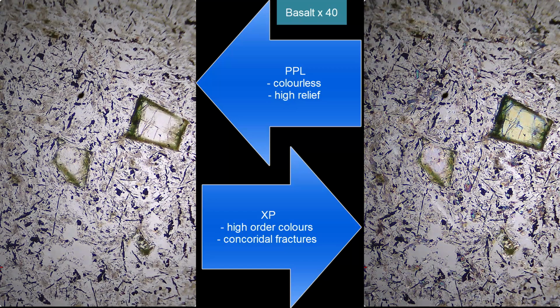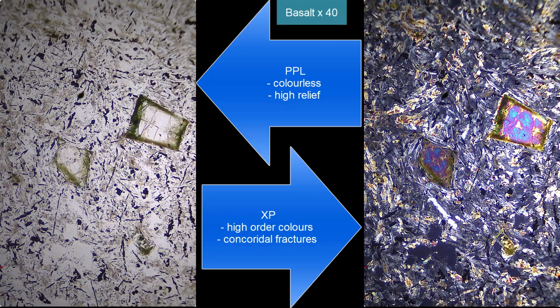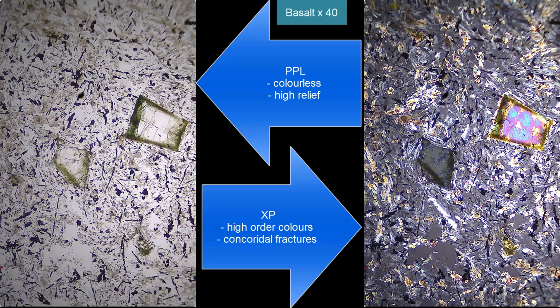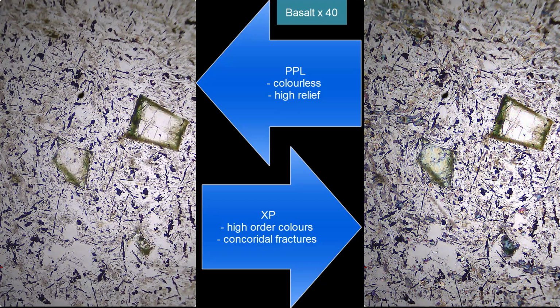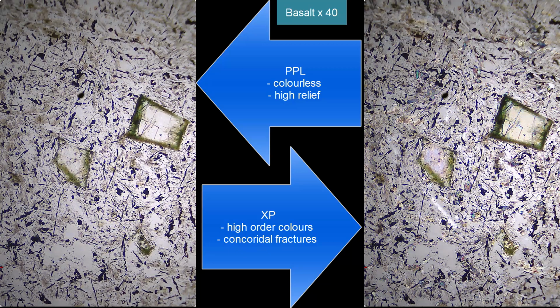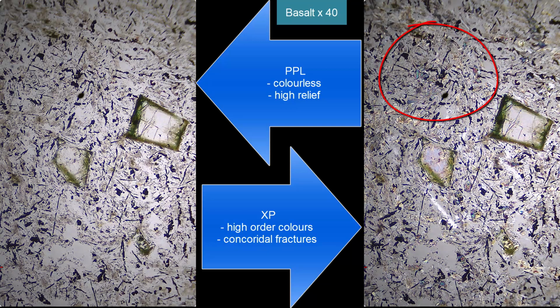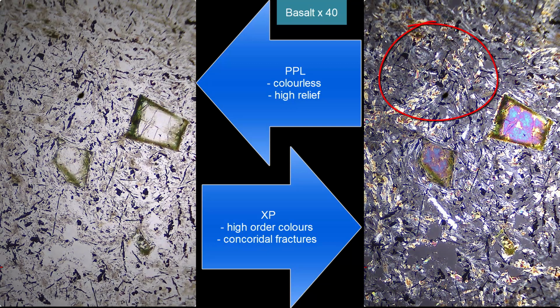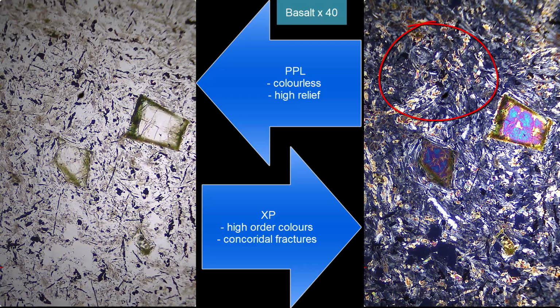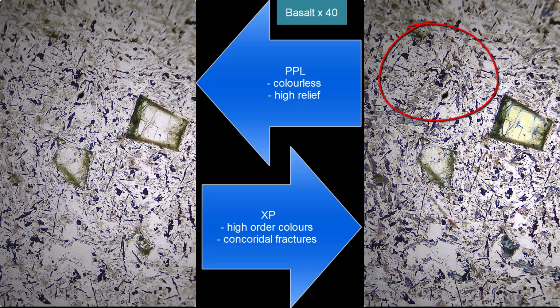So this is the last video, and I'm sort of doing it to highlight why I didn't use more extrusive fine-grained rocks such as basalt, andesite, rhyolite. That's good to just demonstrate one here. So you can see the crystals are really small, and so the features are much more difficult to make out. And so it takes a lot more work to determine what you have here. At least you can tell that you have an extrusive rock versus an intrusive rock. So that's helpful in and of itself.